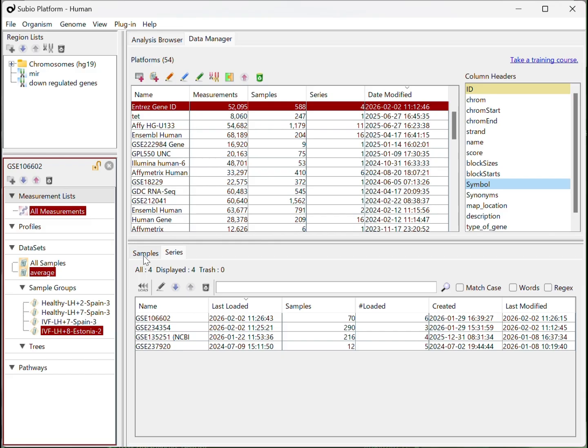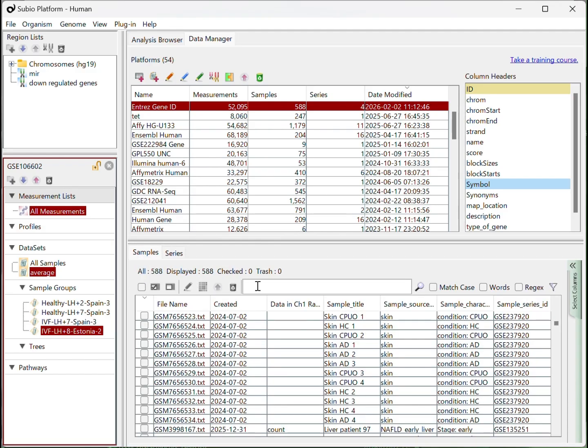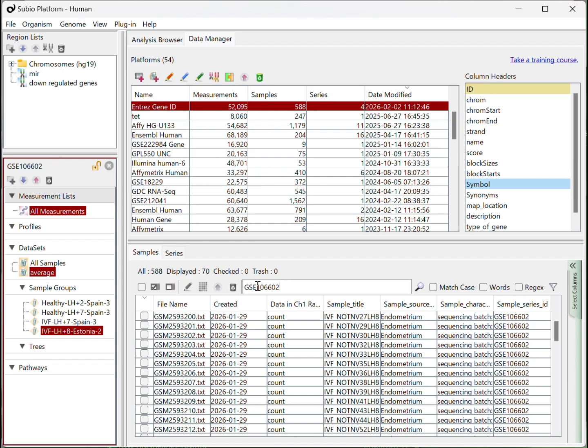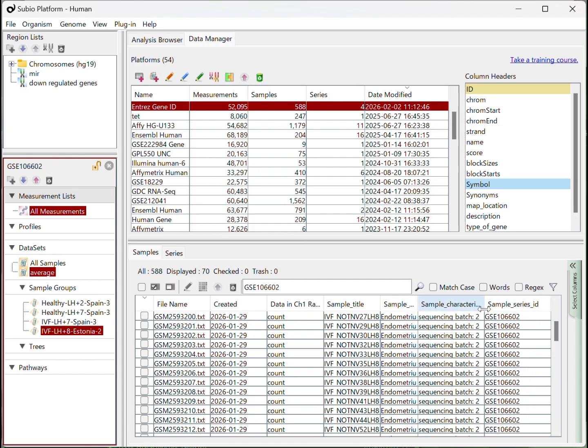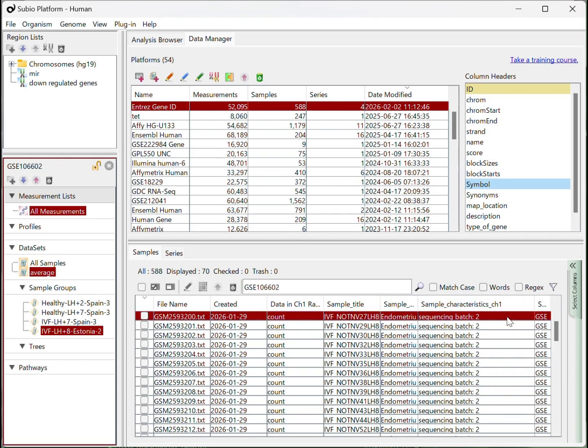On the other hand, if you want to import the parameters in the characteristics field into the sample information table, we recommend importing all parameters in the sample_characteristics_ch1 field without unbundling. Otherwise, the columns blow up to become unmanageable.